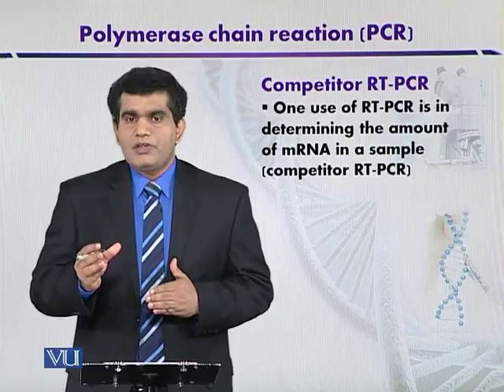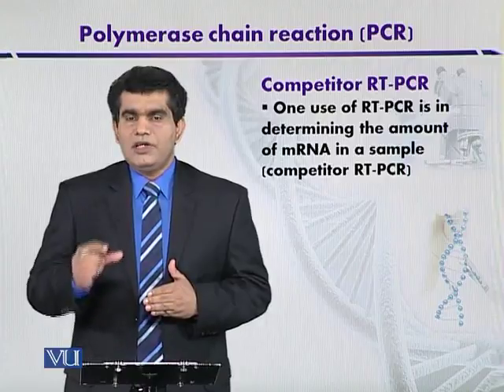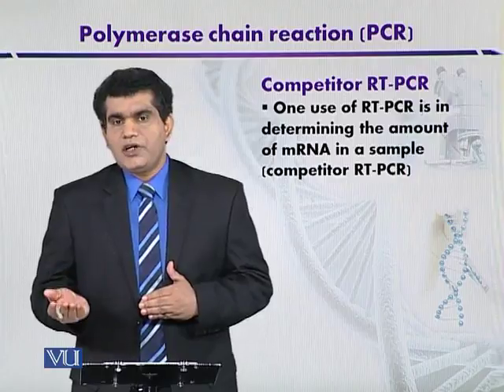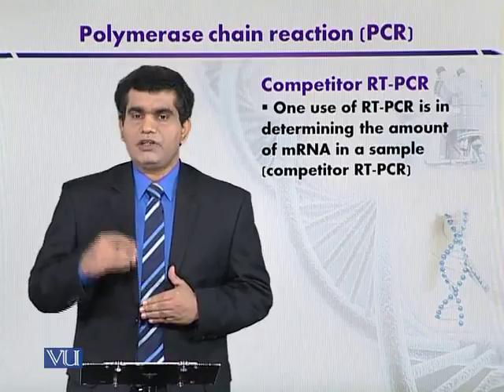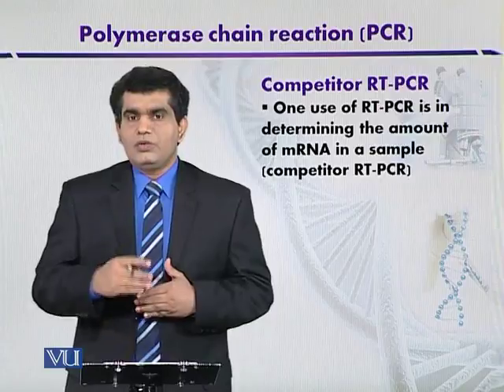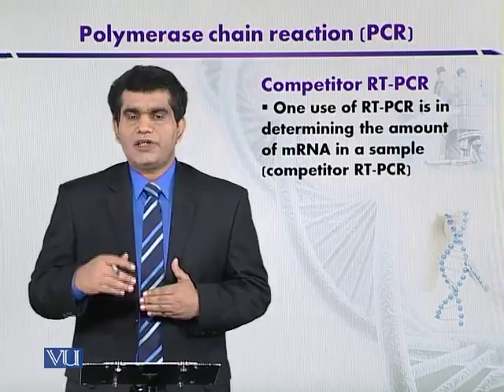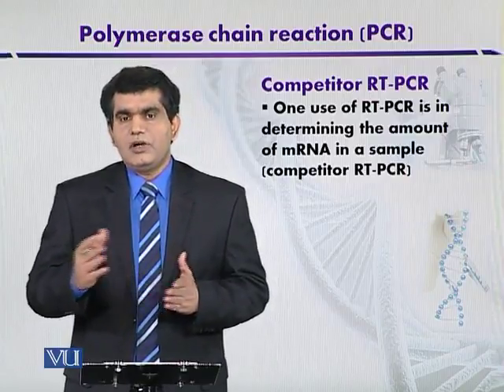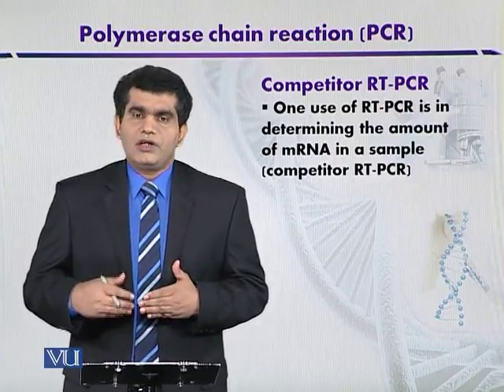तो जब दोनों फ्रेगमेंट्स हों, टारगेट भी और हमारा कंपटीटर भी रिएक्शन मिक्सचर के अंदर एक ही वायल के अंदर, तो ये दोनों जो हैं कंपटीटर आरएनए और target RNA, they will both compete for the resources, for the primers, for other resources in the reaction mixture. So both will amplify together. And we also manage the reaction in such a way that one fragment, like the competitor RNA, is larger or smaller in size as compared to the target RNA.